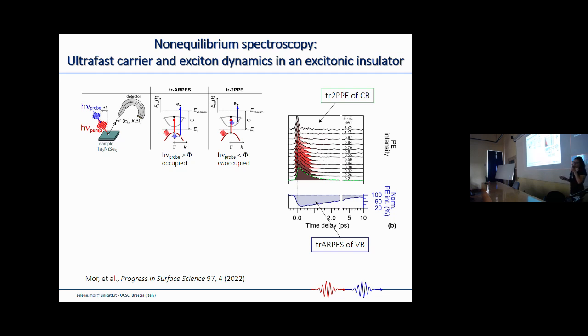But complementarily, we were also performing time-resolved photoemission spectroscopy. Just for the non-expert, these are two complementary measurements done in sequence, because of course you have to tune the photon energy and so on, but under the same experimental conditions, one after the other. So ideally, when you can match the time scales and everything in terms of experimental conditions, you can complementarily see the evolution of the valence band in time.